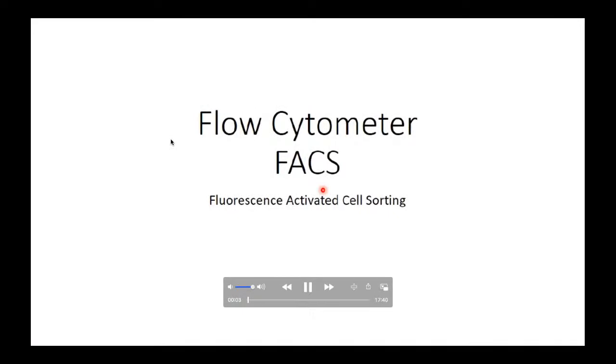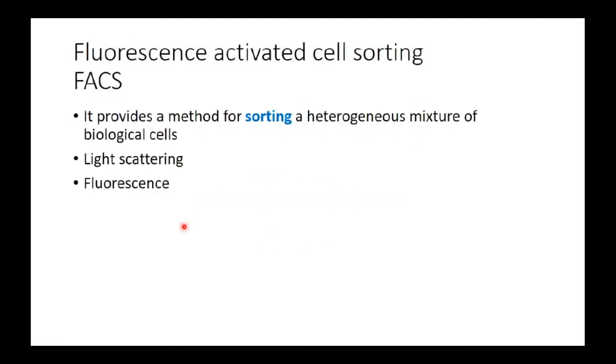Hello guys, this is a continuation of the subject flow cytometer and FACS mechanism. In the previous video, I spoke in details about flow cytometer, and in this video I'm going to speak about FACS mechanism, fluorescence activated cell sorting. If you didn't watch the previous video, I highly recommend you to go and watch it, because it will be much easier to understand FACS mechanism if you fully understand the flow cytometer mechanism. So let's start speaking about FACS.